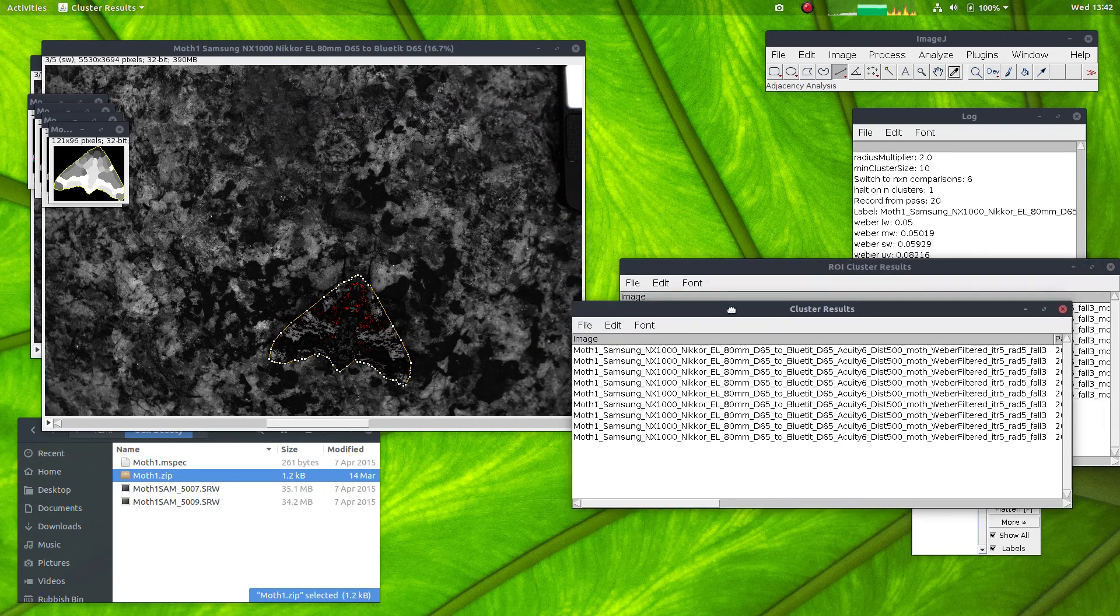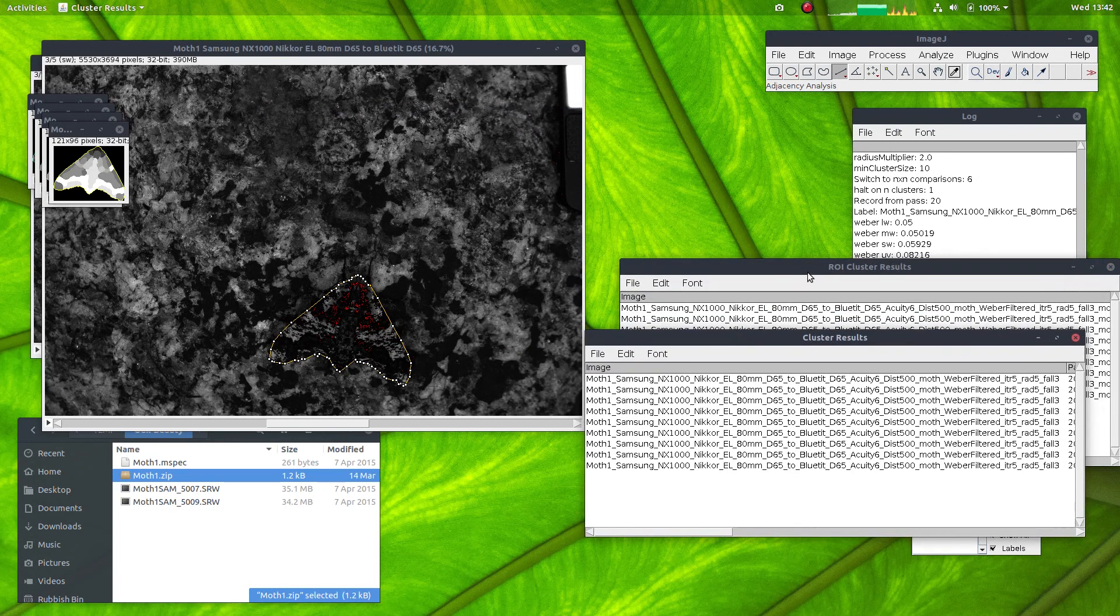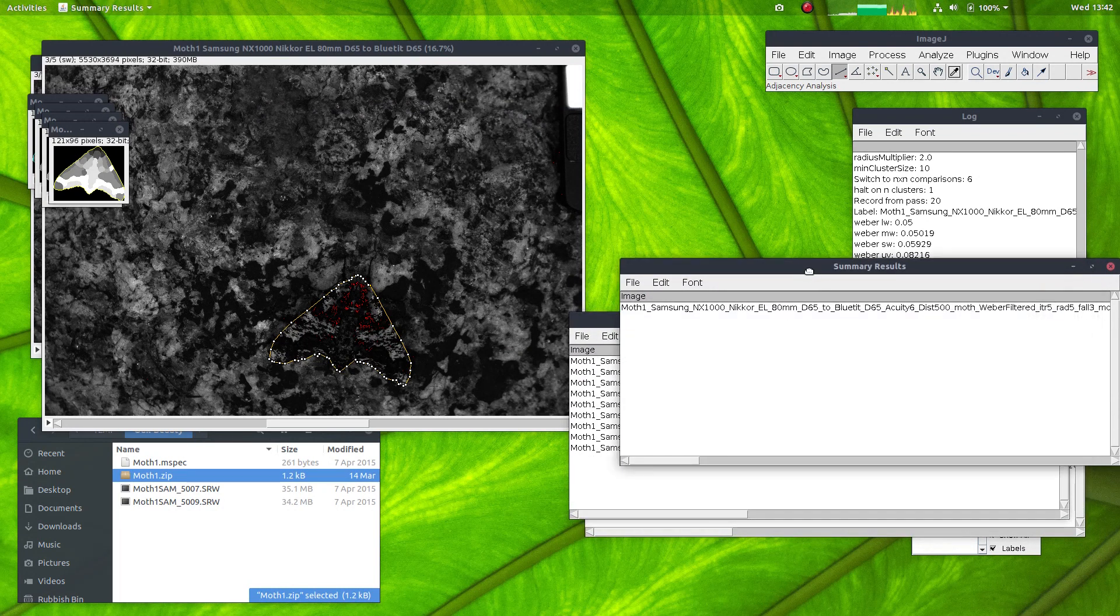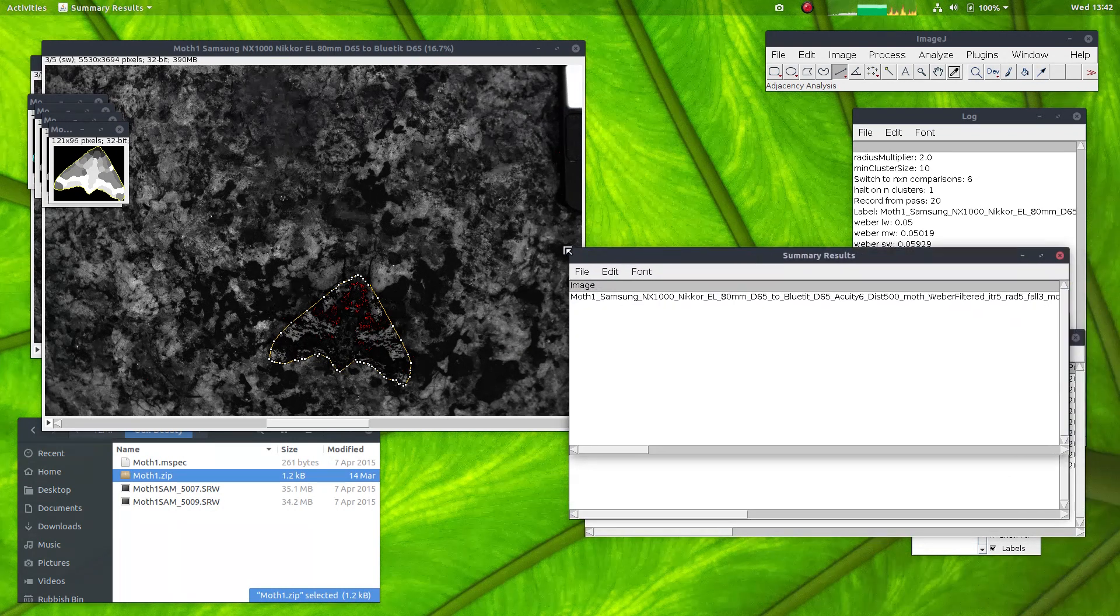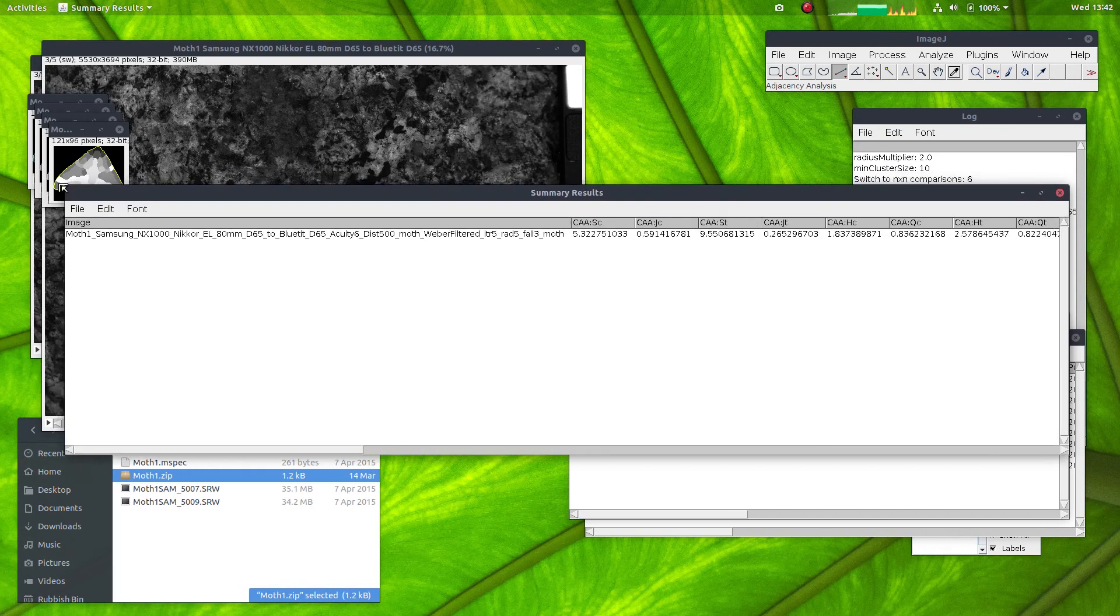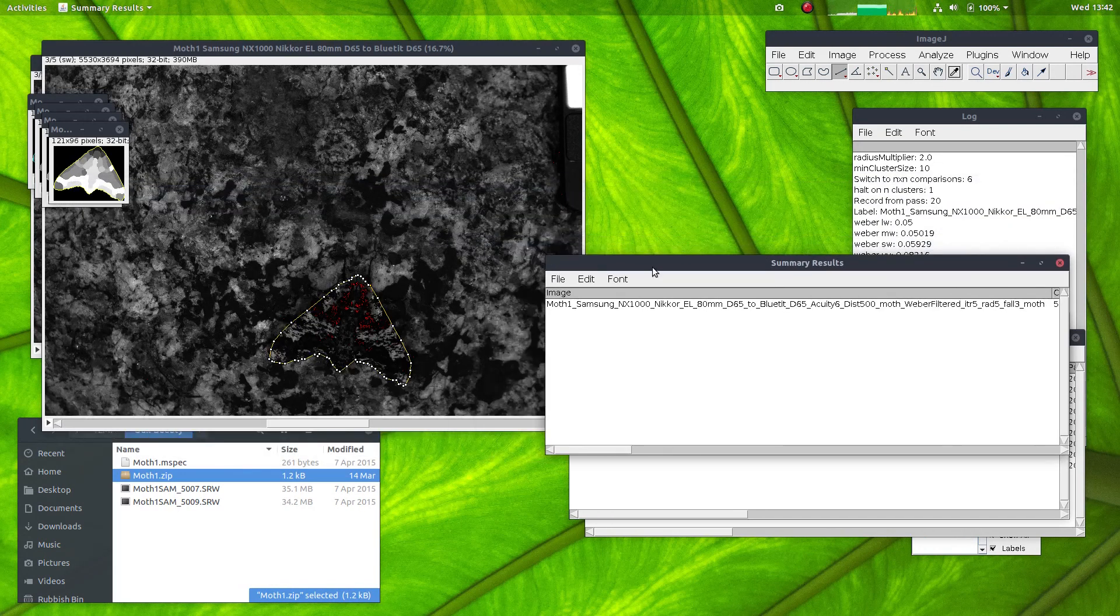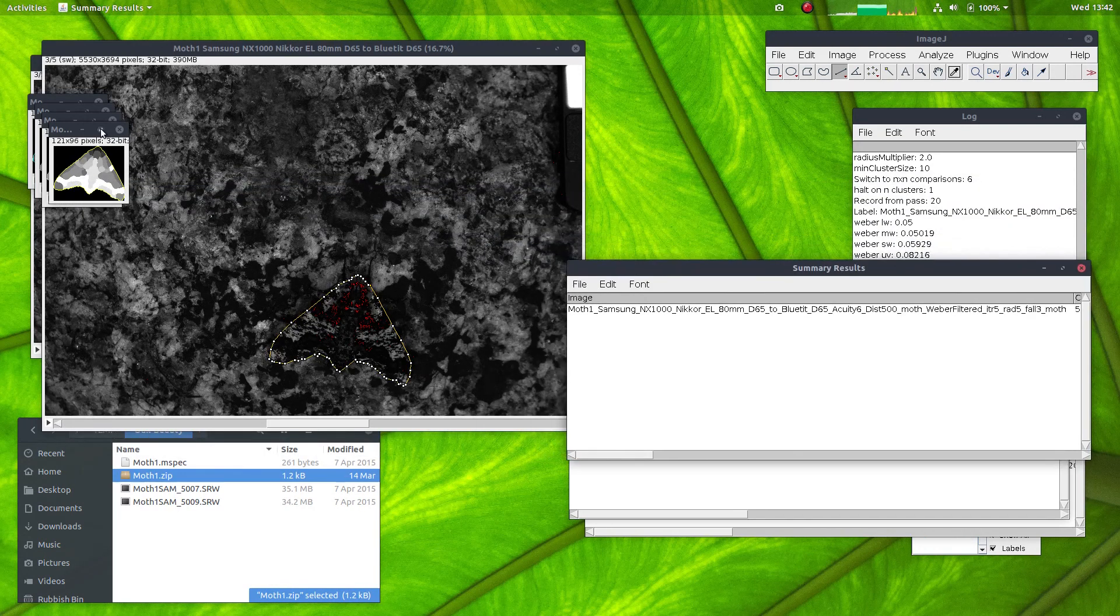Okay, so here we have the cluster results, ROI results, and the summary results for the moth on its own. And I'll leave all of these results windows open.